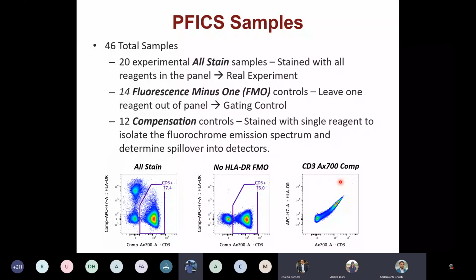Ankita, do you see any more questions? Yes, I can find one more question, which is technical and should be addressed by Dr. Amlan, from Shalmali. She's asking, Amlan sir, can you please explain how to change the width of the histogram? I think she's referring to the transform function. Amlan is anyway going to give a live demo on that, so it will be better to explain when it comes. Yes, that would be more appropriate if I show it there.